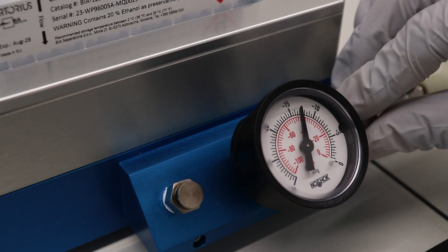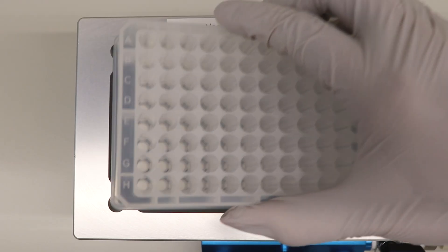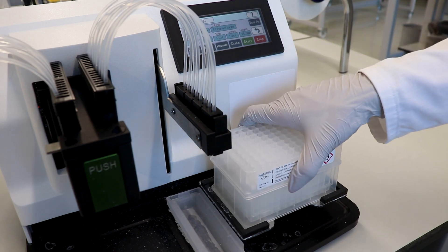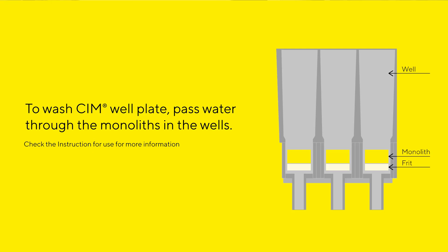We can operate plates with pressures of up to negative 0.6 bar. After removing all storage solution, we need to wash the well plate with water. For a complete wash, use at least 10 monolith volumes.